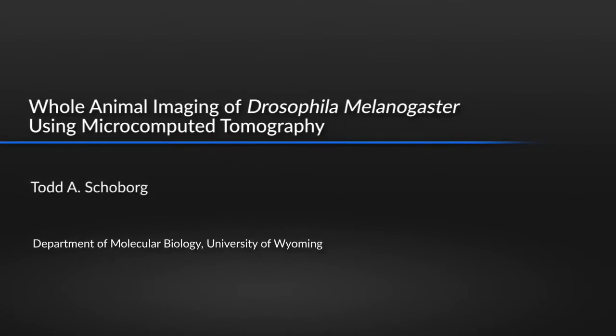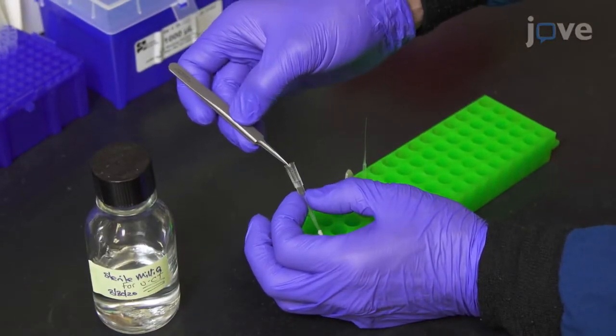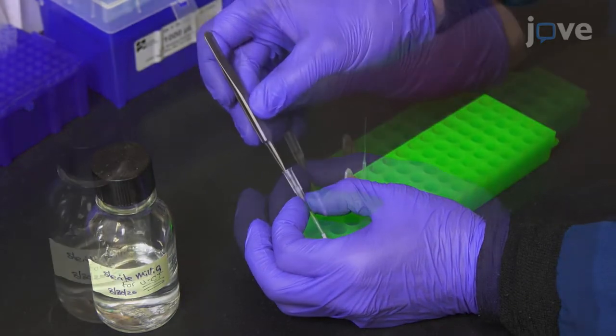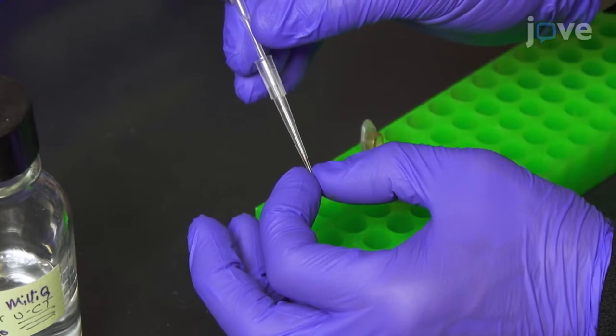This protocol allows for the non-destructive imaging of intact Drosophila at micron resolution. It can be used to understand mechanisms of animal physiology, anatomy, and development. Because the flies are imaged in an intact state without the need for tissue dissection, the spatial architecture of tissue and organs are maintained in their native state and are easily observed.